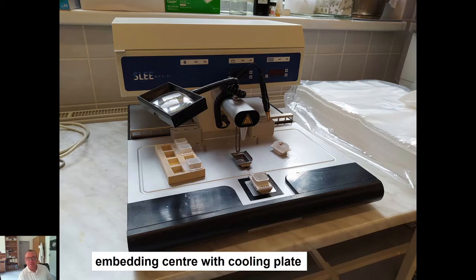The tissue infiltrated by paraffin is given to this mold, and from this the paraffin goes down and fills the mold.